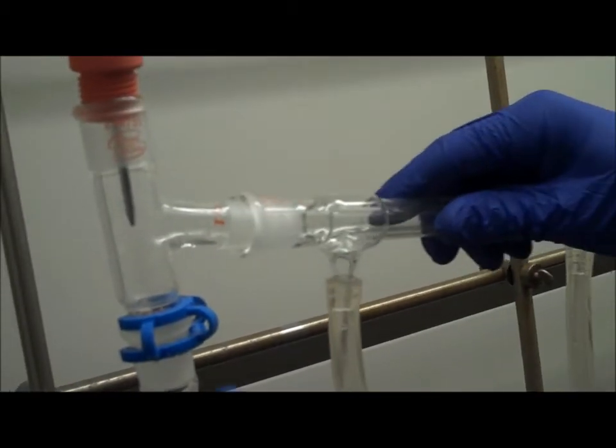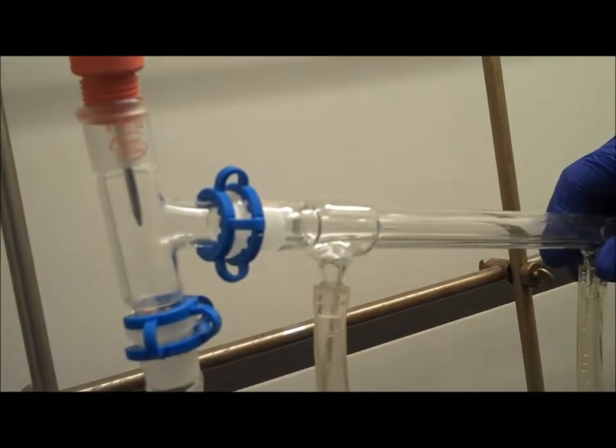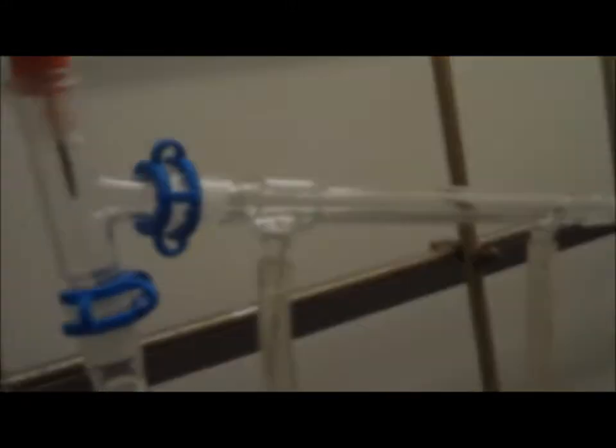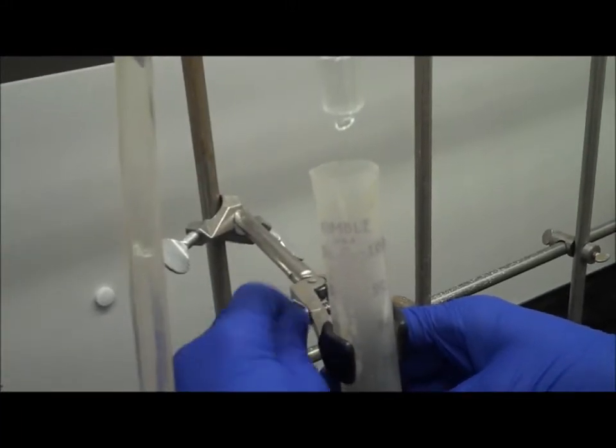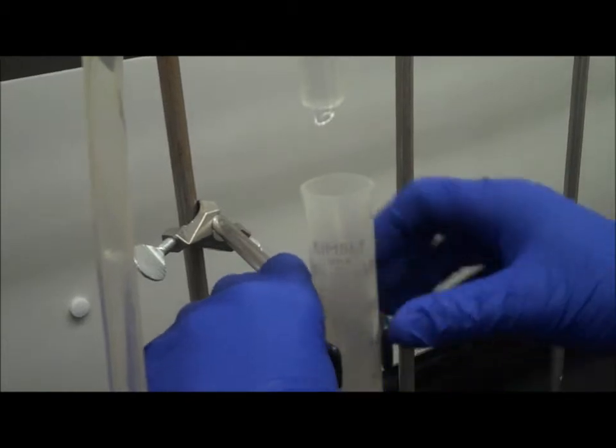We're connecting all glasswork using a clip securely attached here. Next, connect a 100 milliliter graduated cylinder underneath the spout to collect the distillate.